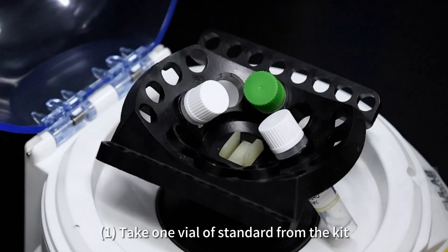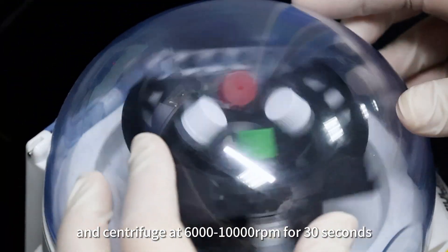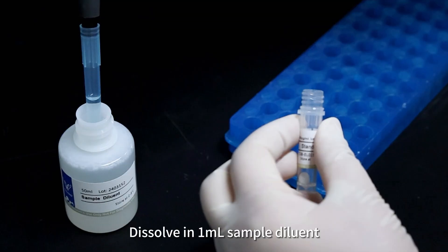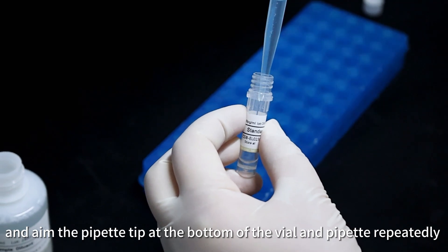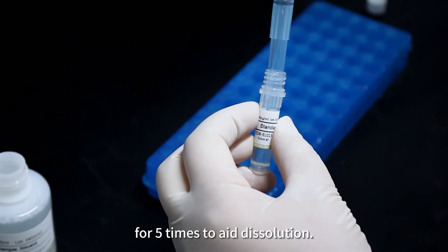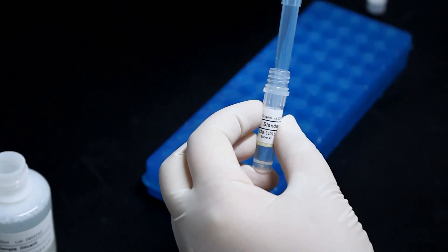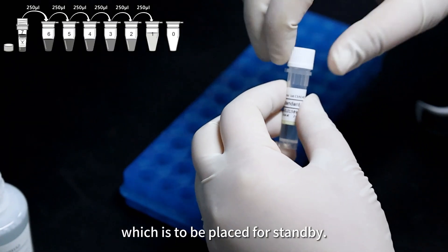Take one vial of standard from the kit and centrifuge at 6,000–10,000 RPM for 30 seconds. Dissolve in one milliliter of sample diluent, aiming the pipette tip at the bottom of the vial and pipetting repeatedly five times to aid dissolution. Mix well to obtain standard S7, which is to be placed on standby.